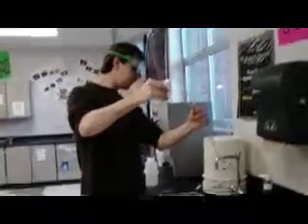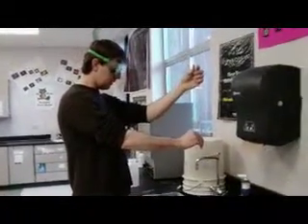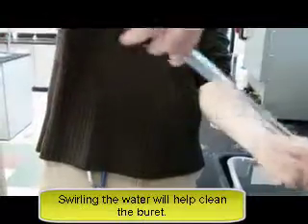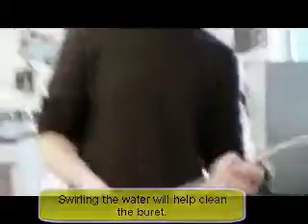Okay, so the easiest way to do this is just to get a little bit of water. Now be careful. Up and down is open, across is closed. So you're always going to rinse it. Basically, you just need to put a few milliliters in there. You're going to let the water run through a little bit, and you also need to twist it and twirl it like this so you get the inside coated with the water, and then let it run out. That's going to clean out anything that you have in there. Do that with tap water and then also with distilled water.